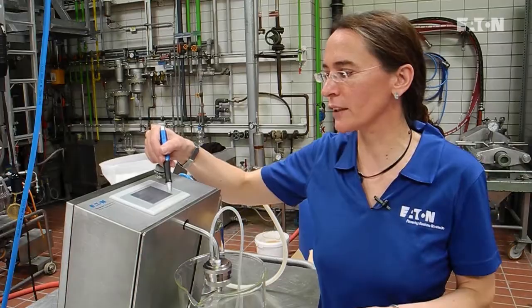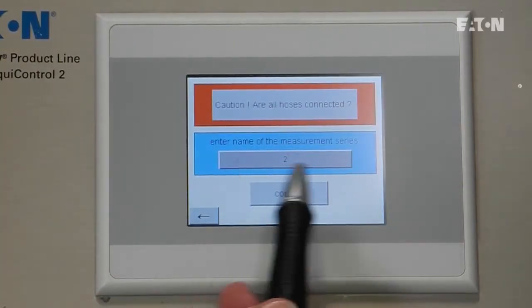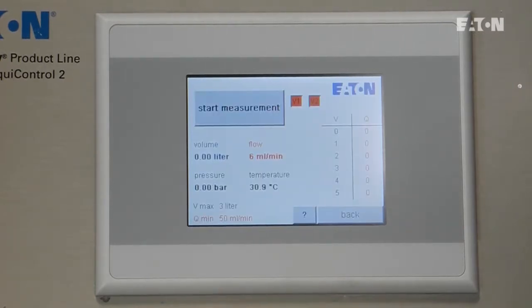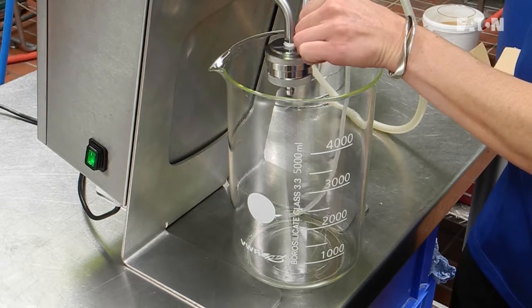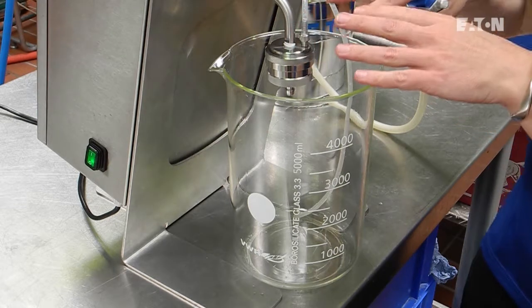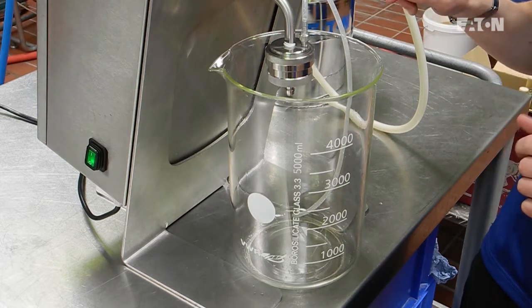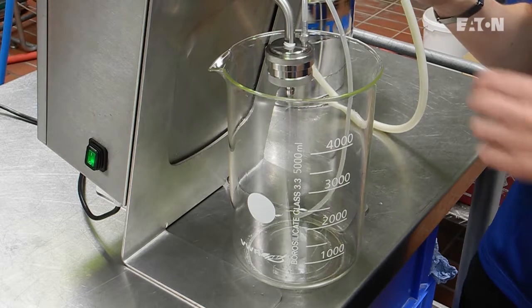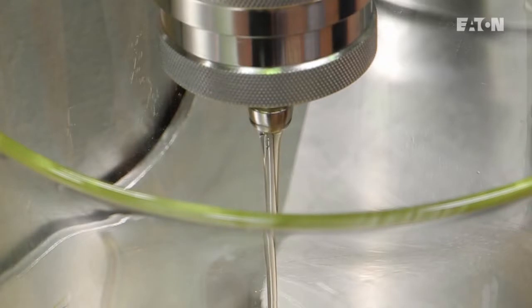Once everything is set, we can easily start with the measurement. We go back to the main menu and start measuring. We vent the system and open the syringe a little bit so that all the air bubbles can escape. It takes a while, and afterwards the measurement starts. We close the syringe, and now the measurement starts after 200 milliliters.